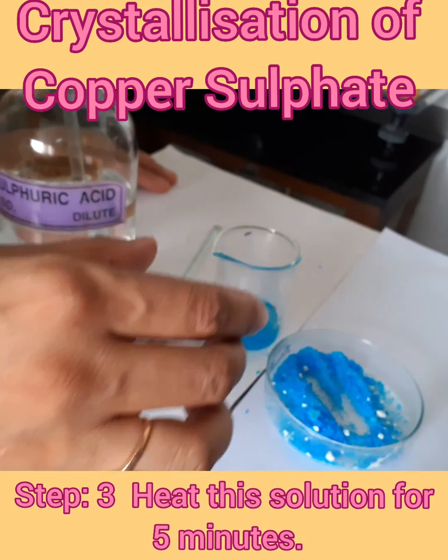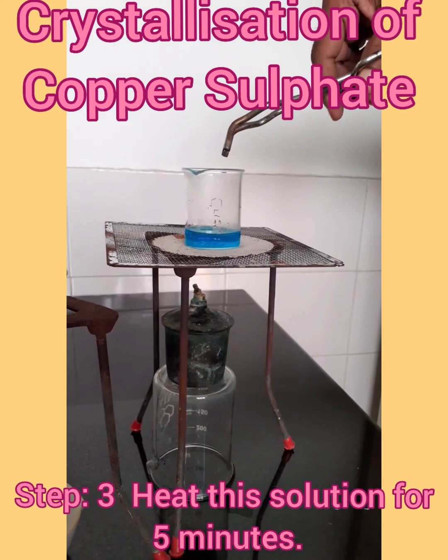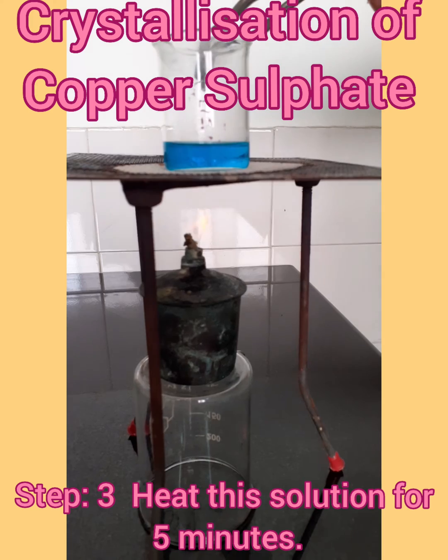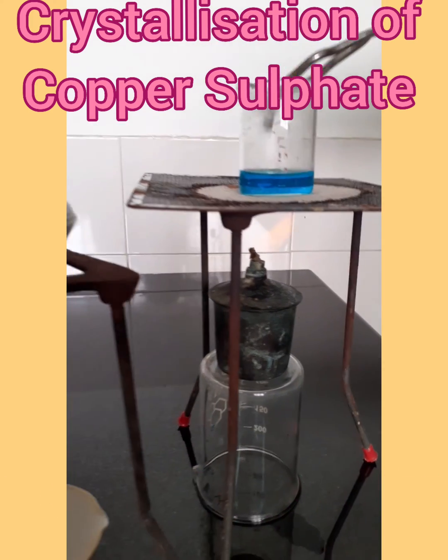Now we will put this onto the flame for making the saturated solution. We are heating it so that the maximum amount of copper sulphate can be dissolved.